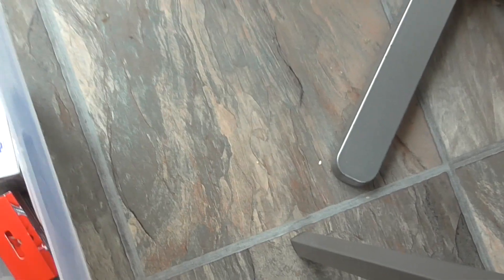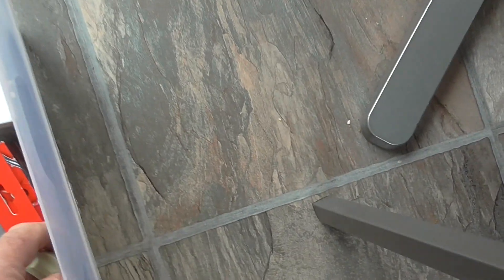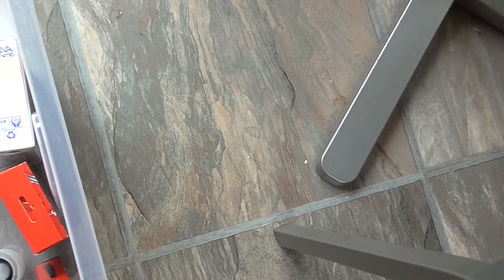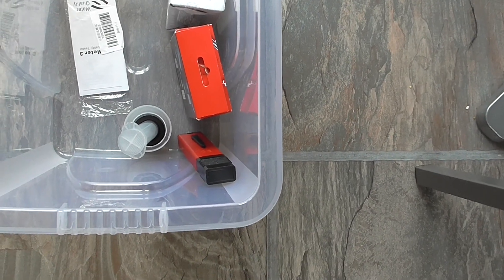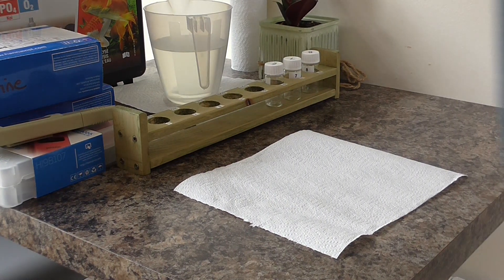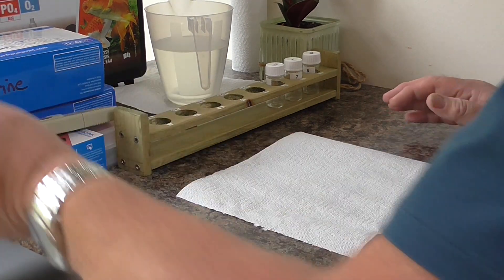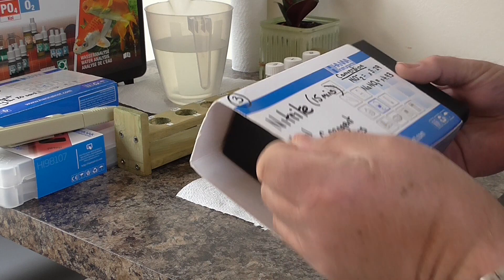I've also got a pH meter for reading pH, and I have a meter for total dissolved solids. So let's start with the nitrite.